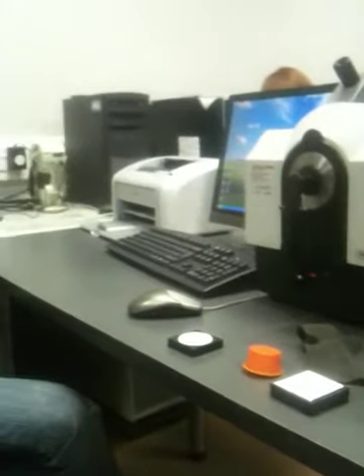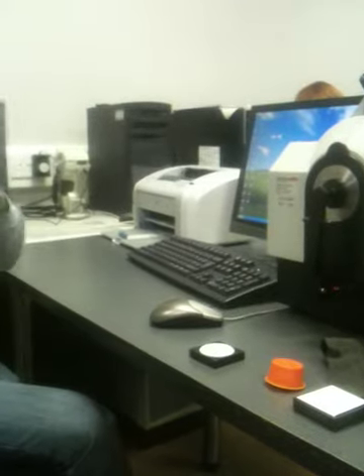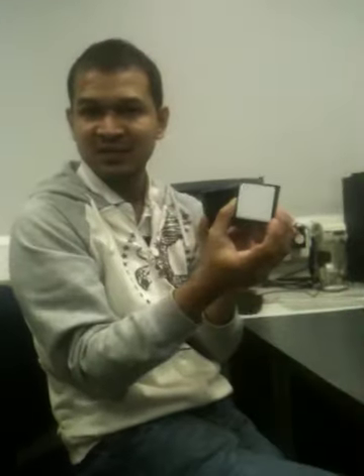Okay? And what is the standard? Basically 3 standards. One is black, one is white, and one is in between. And what is the significance of it? You're seeing the holes. When you put the sample here and we measure, there's a light source. Black means all the lights are absorbed, theoretically at least. You can produce a product which practically absorbs almost anything, but theoretically it means 0% light reflected. And white means? 100%.